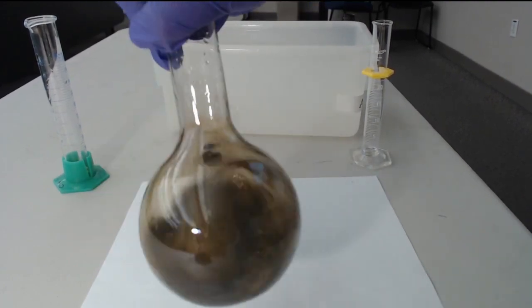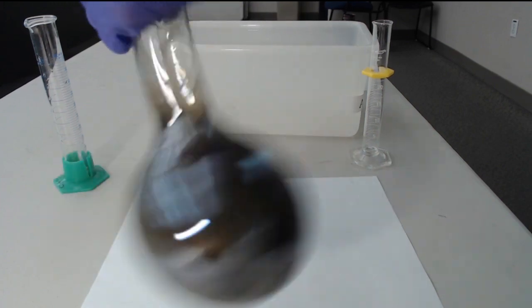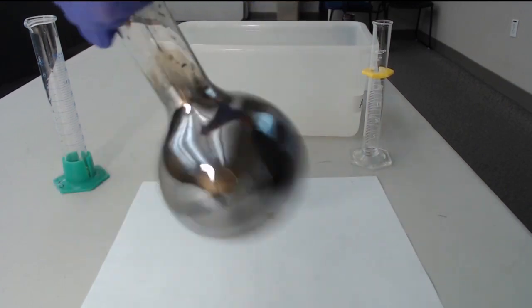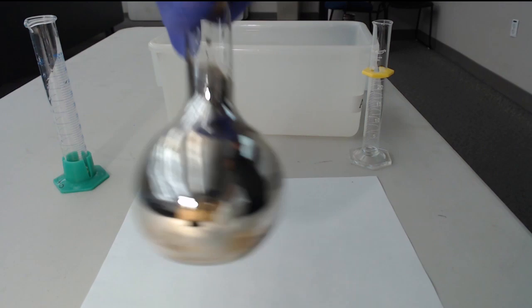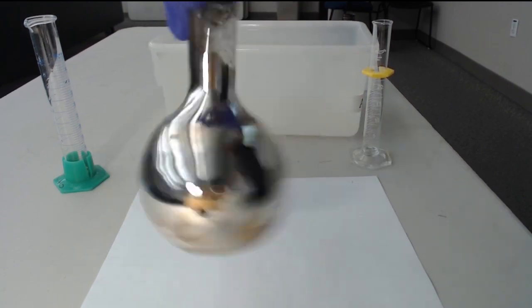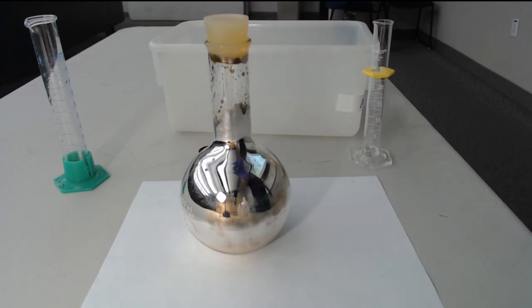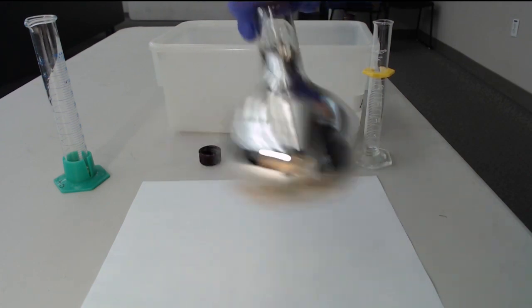So did it change color at all? It went like almost a brown color now. Unfortunately, I got to keep it stirring to get the reaction to go. Let me know if you guys are seeing anything. What kind of reaction are you seeing? Is it changing color? What happened? Is it a little bit more obvious that there was silver in here now? Yeah.